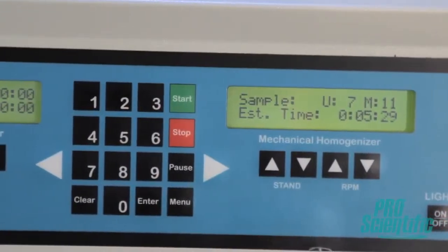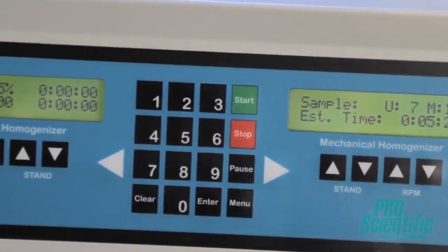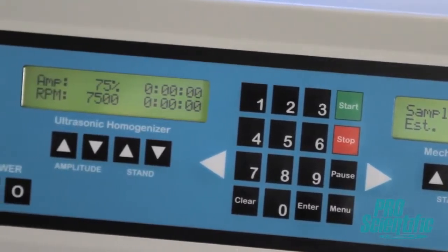It's this last configuration of a revolutionary dual processing homogenizer that I'd like to focus on first. Sample prep becomes even more tedious and cumbersome when you need to break down a large, tough solid to the submicron level because multiple pieces of homogenizing equipment are needed. But the DPS20 combines mechanical homogenizing and sonication, so you only need one compact unit.